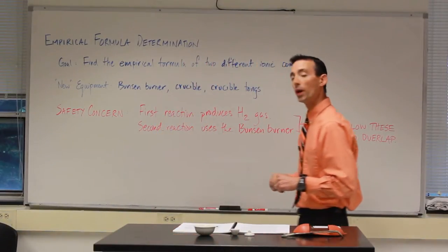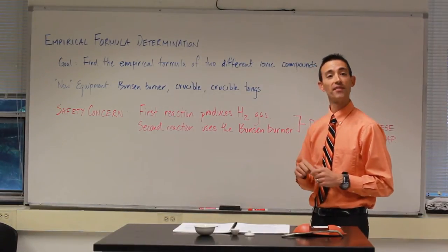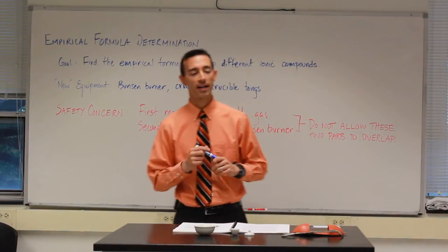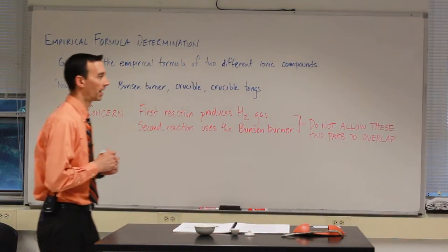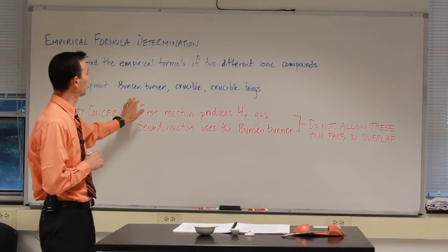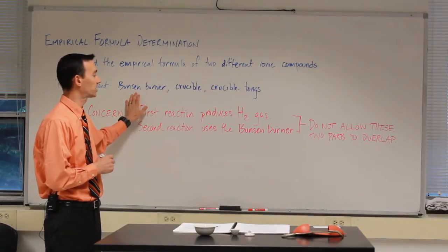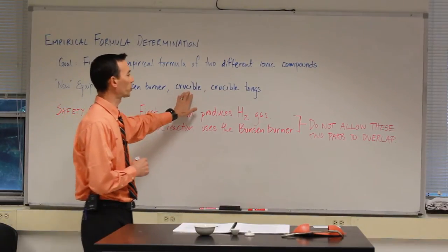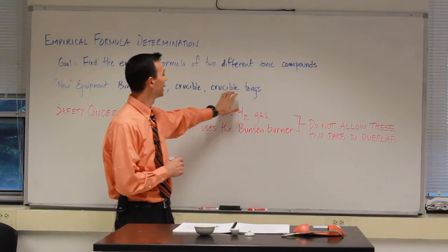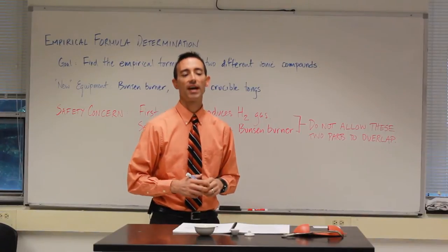Now, with that new chemistry comes some new equipment and some safety concerns. Let's walk through those right away at the top of the pre-lab video. Some new equipment that we're going to see are the use of a Bunsen burner to heat up and promote one of our reactions today, and a special crucible to contain that reaction, and then crucible tongs to handle that crucible when it's very, very hot.